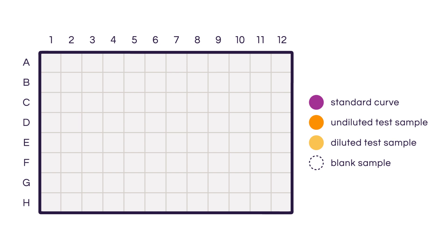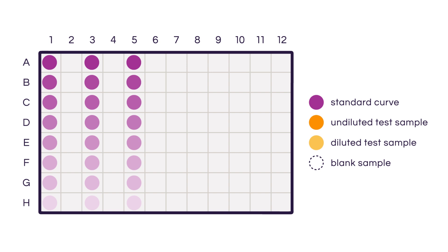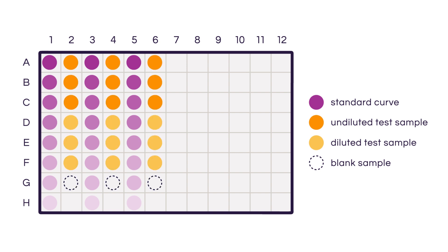Time to add our samples to the plate. We're going to add 25 microliters of sample per well. Because this is not an endpoint reaction — meaning the biuret reaction never truly stops — we're going to spread those samples across the plate. In our case, we have decided to load the standard curve samples on columns 1, 3, and 5, and our unknown samples and blanks on columns 2, 4, and 6.